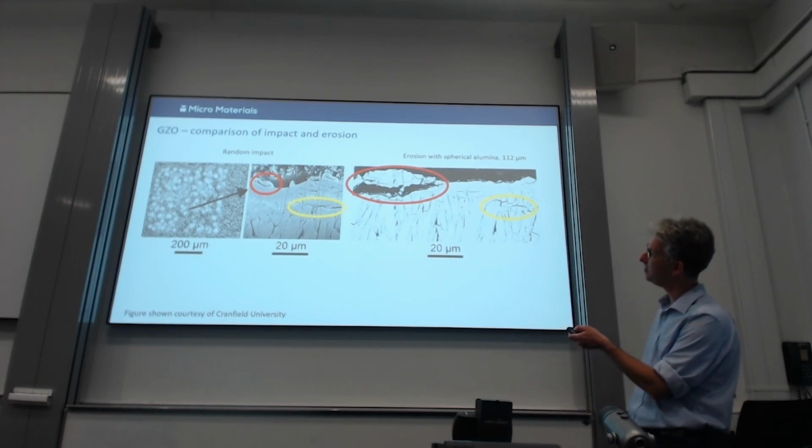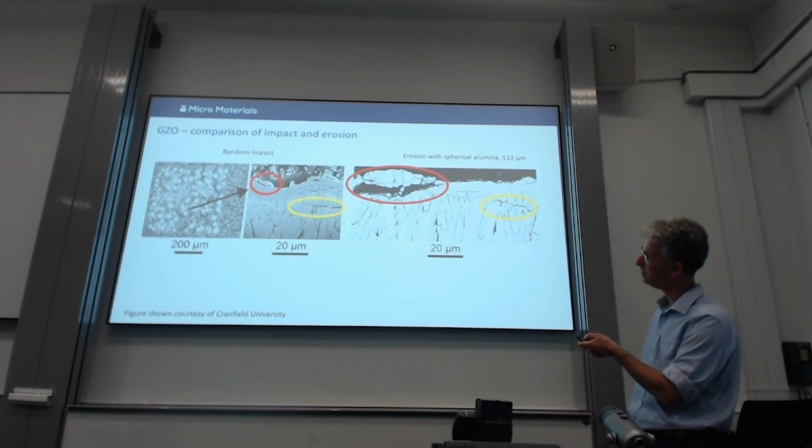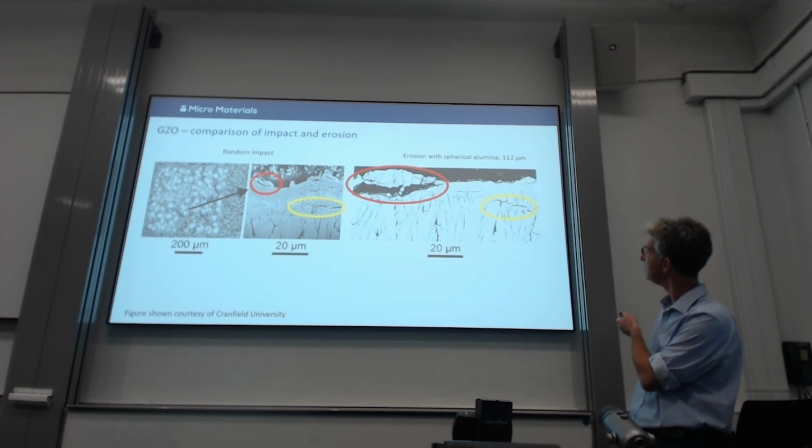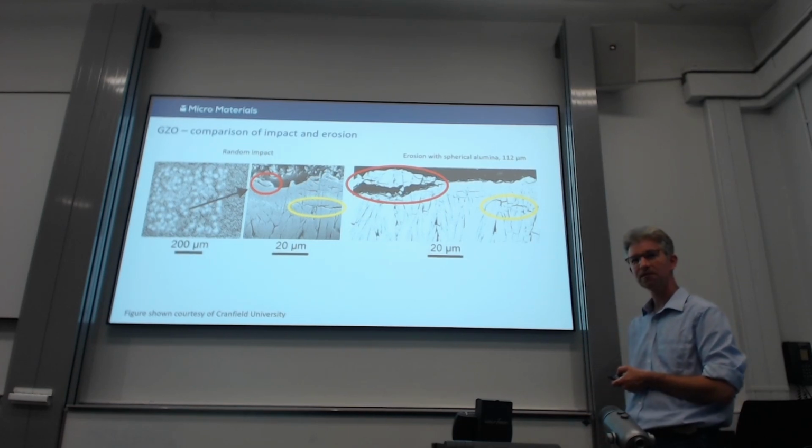Again, similarly, you can see on the left is impact, on the right is erosion. Again, same sort of mechanisms. In this case we're replicating nicely subsurface cracking and flaking, with exactly the same mechanisms on the right. So, that gives us lots of confidence.